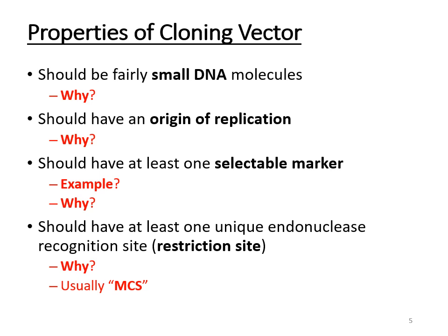But for now, think of it as multiple cloning sites, or MCS. The reason that you want these multiple cloning sites or these restriction sites is it allows you to cut open that plasmid or that vector and manipulate the DNA. You can then insert whatever genes you want into that ring of DNA and pop it into the bacterial cells. Okay, so why should you have a restriction site on the cloning vector? It allows you to manipulate and add new genes to that vector. Very valuable, very powerful.